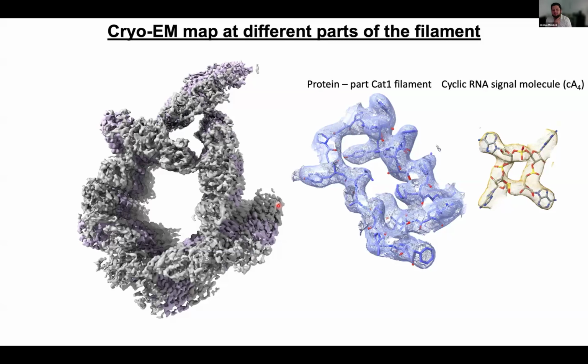I have a question of my own. Why do you think that Topaz worked better than filament picking? Yeah, actually, Filament Tracer did not even pick the micrographs where the filaments were very densely populated. I don't know why exactly that happened, but Topaz worked really well.